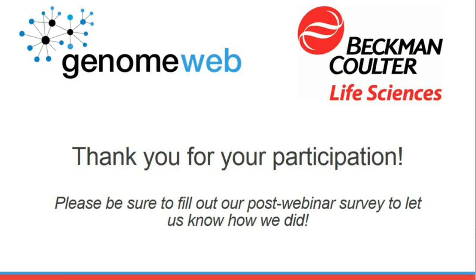Thank you, Davoud. Sohaila, should a user worry about volumes falling down when the destination plate is held upside down, or is that not an issue?